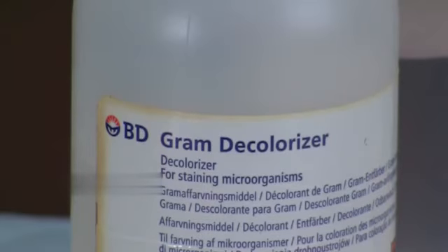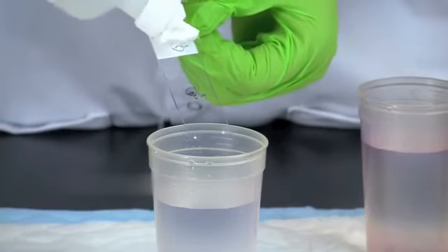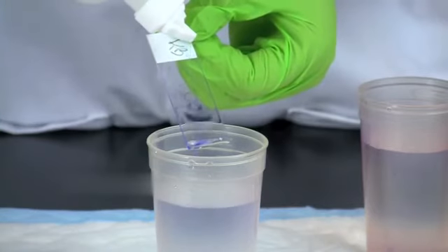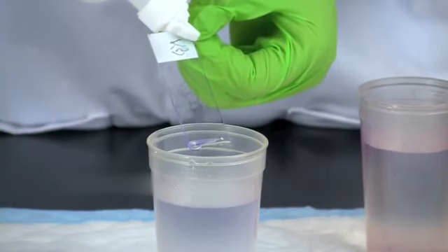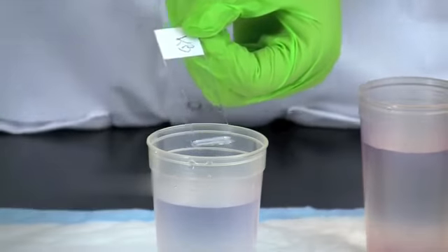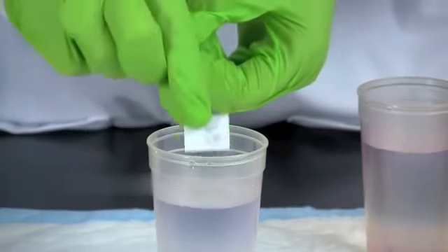Now add a few drops of decolorizer. Let the decolorizer flow over the bacteria at a 45-degree angle until the flow is clear. Then finish by rinsing the slide in a beaker of water.